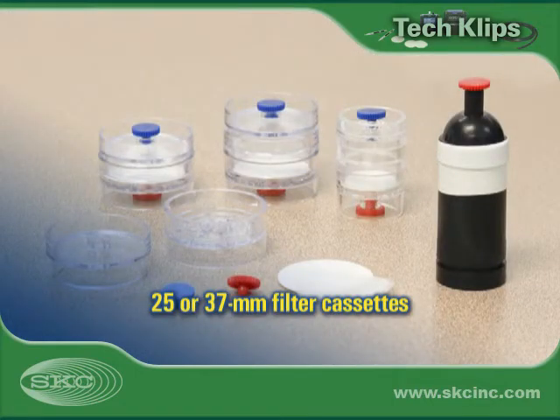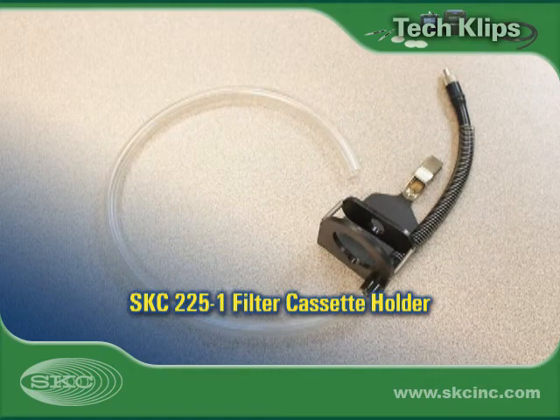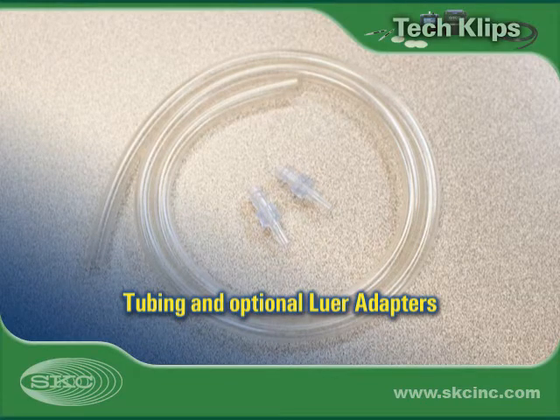Use method-specified filter cassettes, available preloaded with filters and supports, or as separate components for user loading. A filter cassette holder allows sampling media to clip securely onto worker clothing or in the area to be sampled. Tubing connects train components, while optional Luer adapters make it easier to connect tubing to the filter cassette.